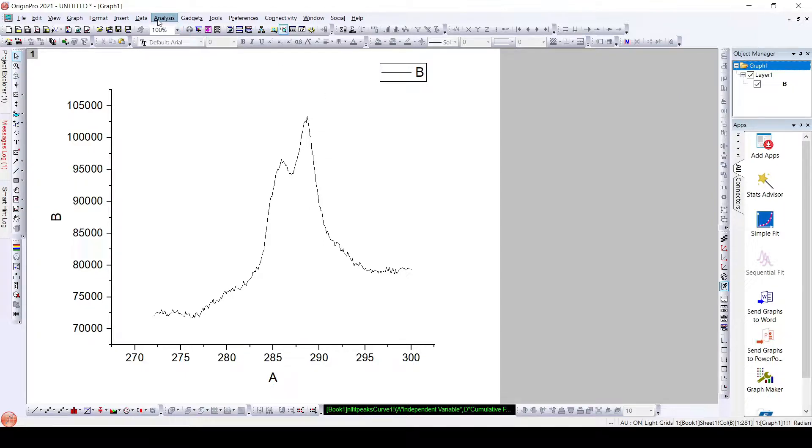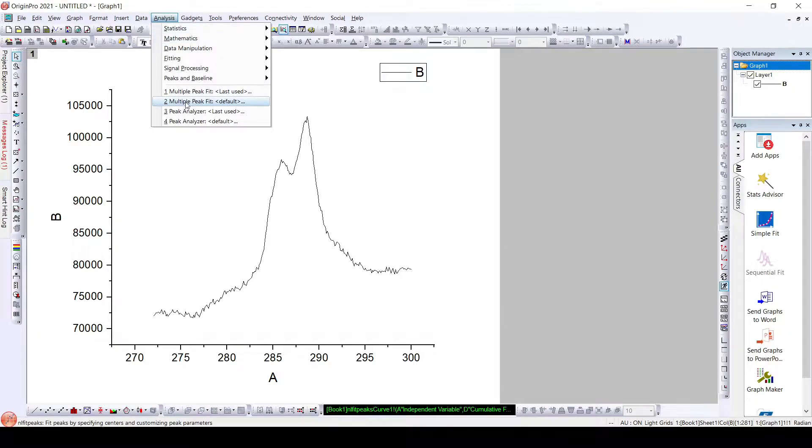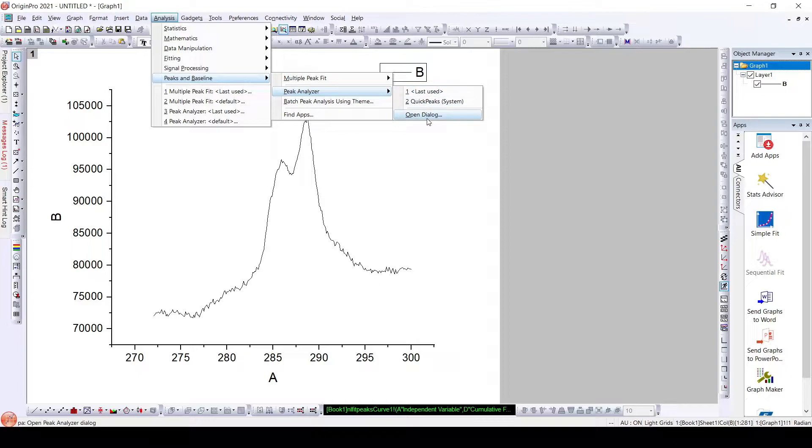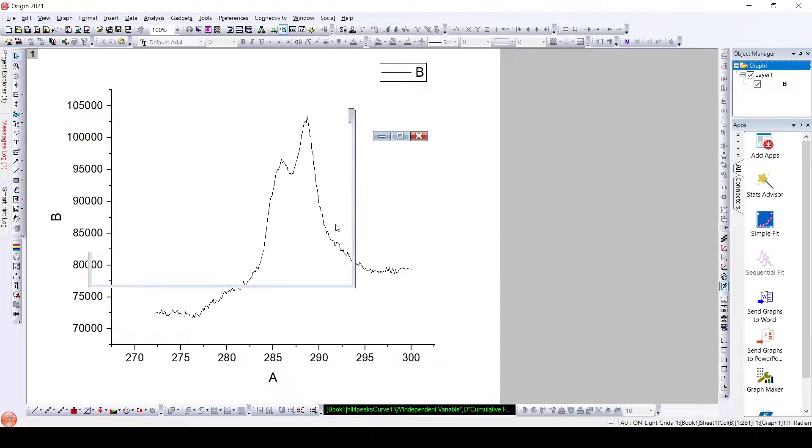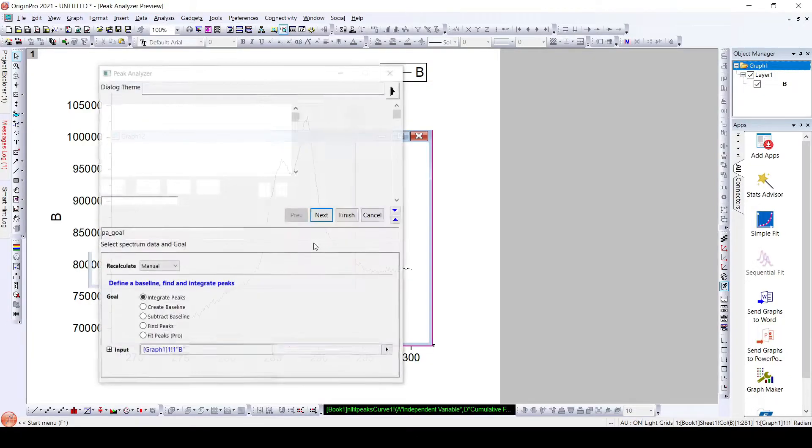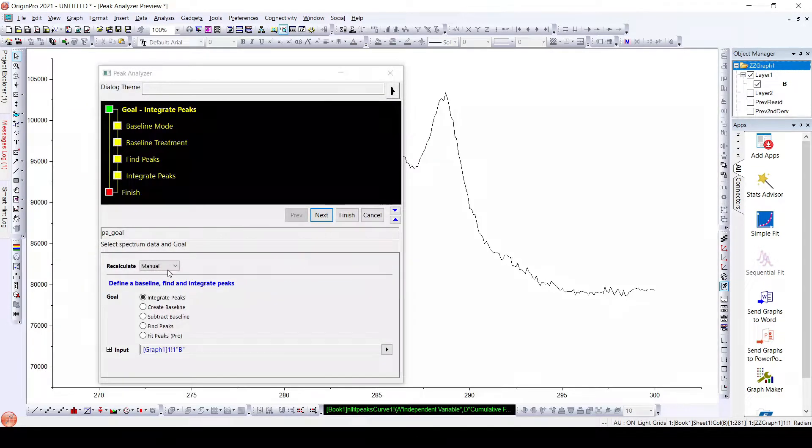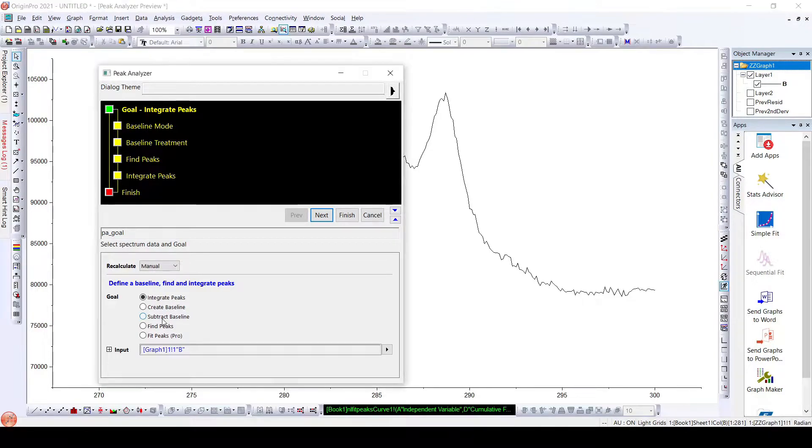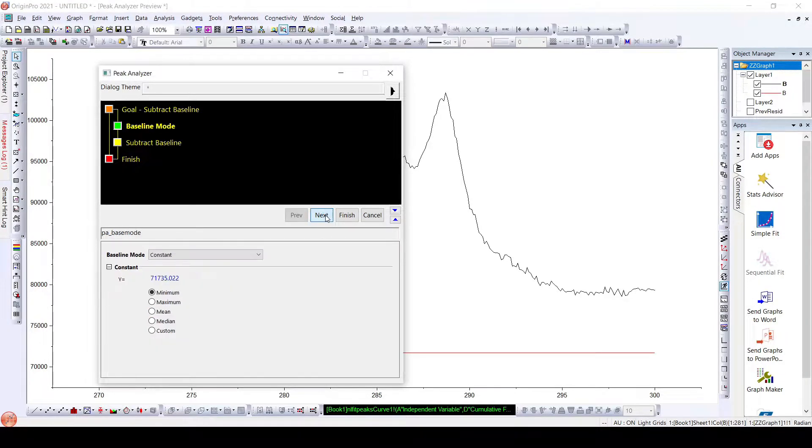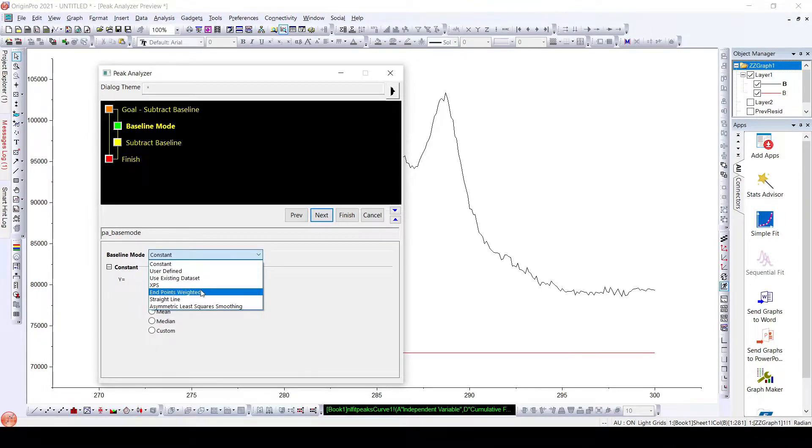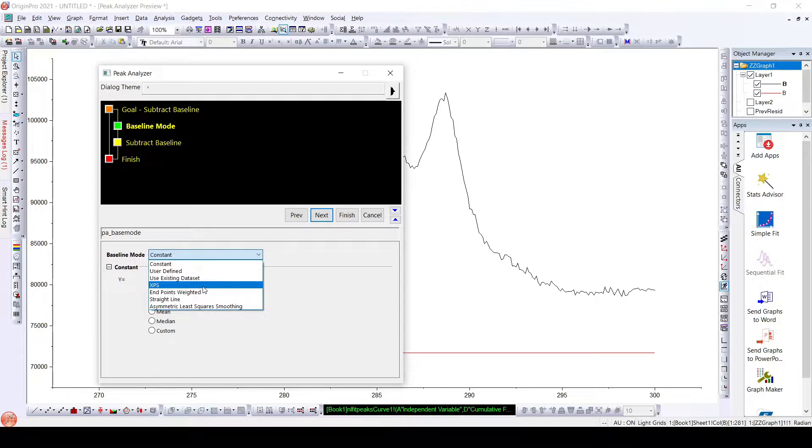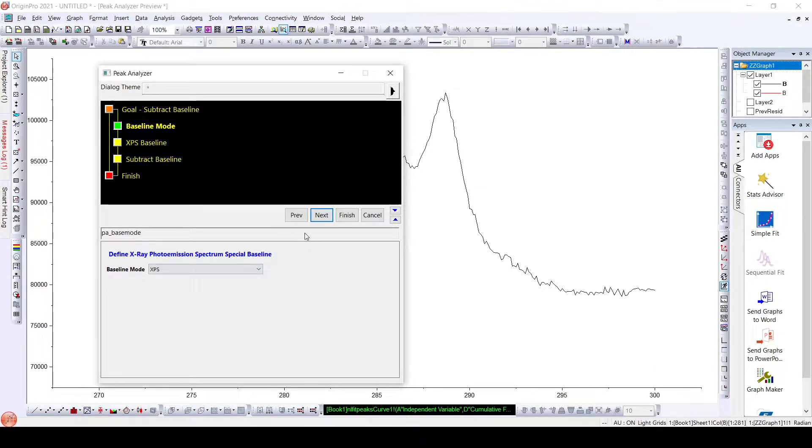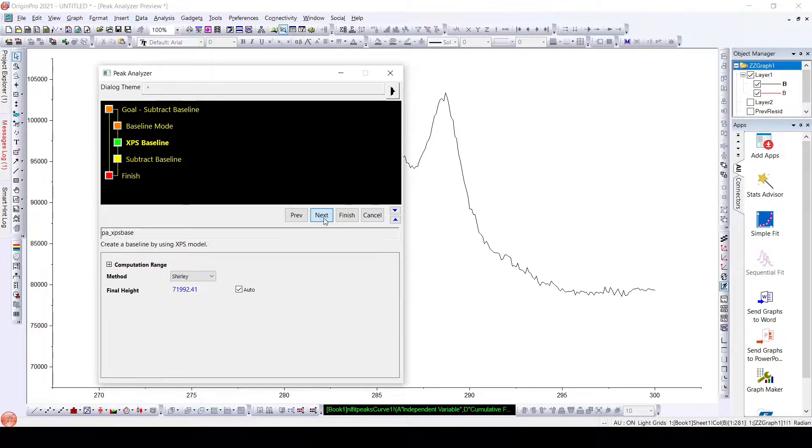For this, go to Analysis, Peaks and Baseline, Peak Analyzer, Open Dialog. Here select Subtract Baseline. Next, as this is XPS data, we will choose the baseline mode to be XPS and click next.